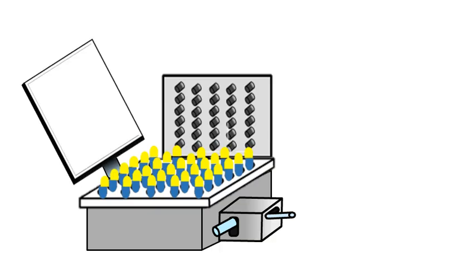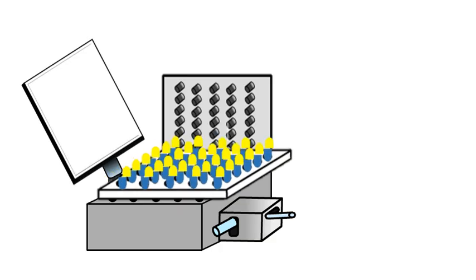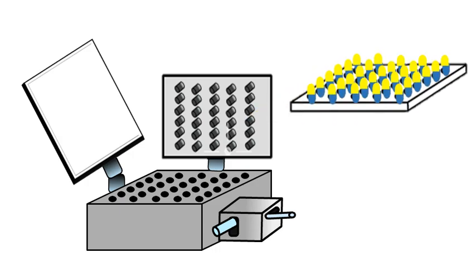Now move the sealing plate upwards in its original position and remove the Loading Tray which will have the filled capsules.